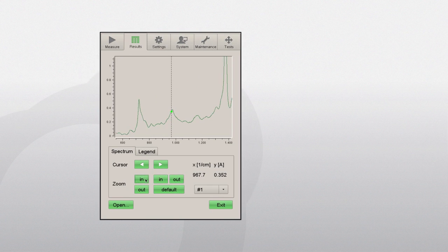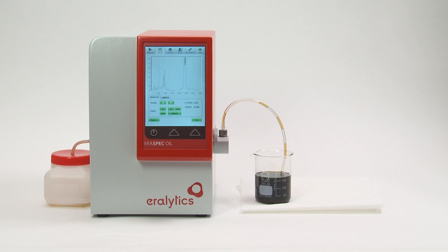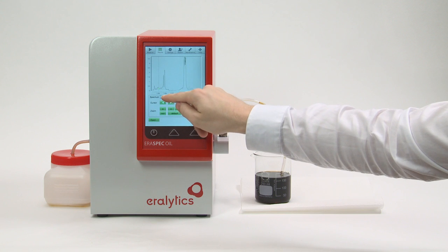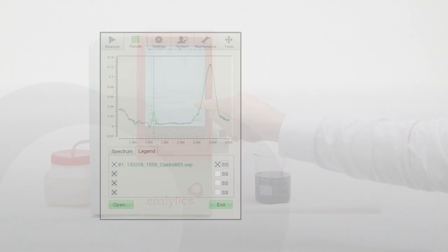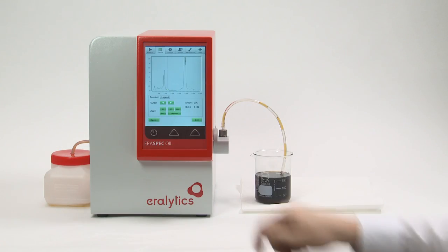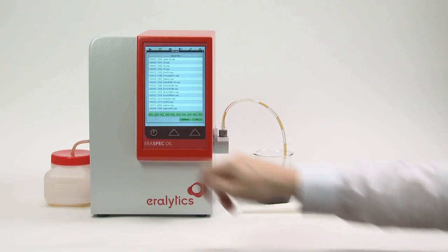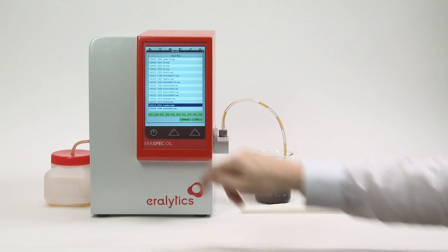For a spectral subtraction measurement, it is possible to view the difference spectrum. Click on the Legend tab and mark the SS box to view this difference spectrum. To compare more spectra, click Open and select the desired spectrum from the list.